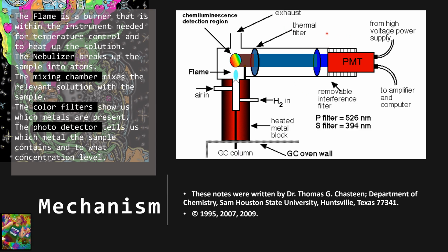Now the question: why is calibration of a flame photometer important? Of course, the most important part of calibrating a flame photometer is to have a point of reference for a reading. Without a point of reference for a specific quantity of light absorbed by the ions, the results are meaningless and nothing more than a measure of current through a photodiode.